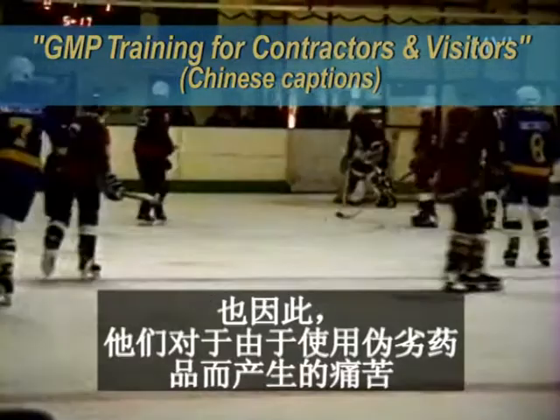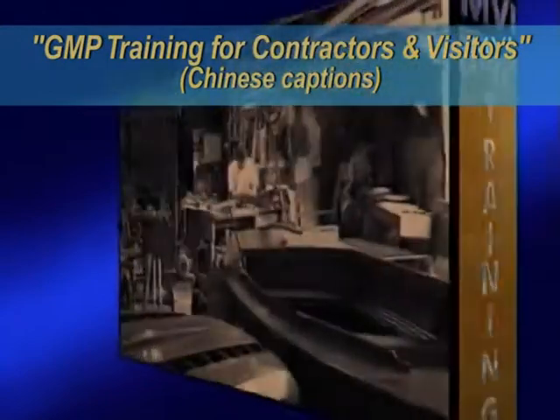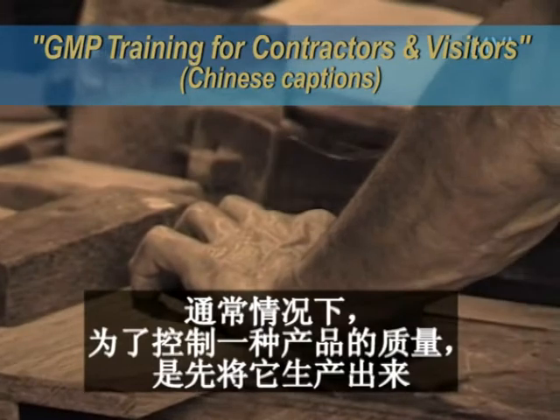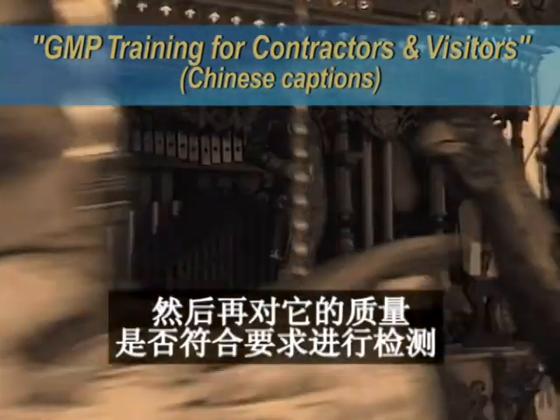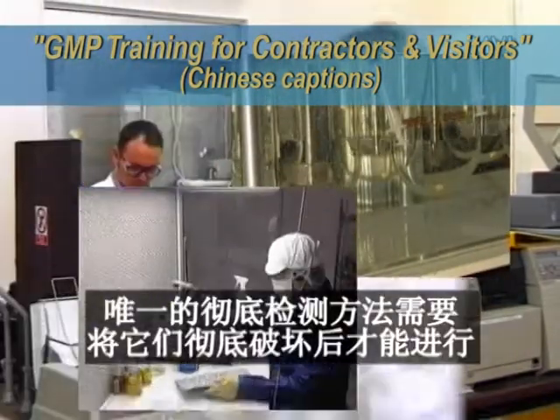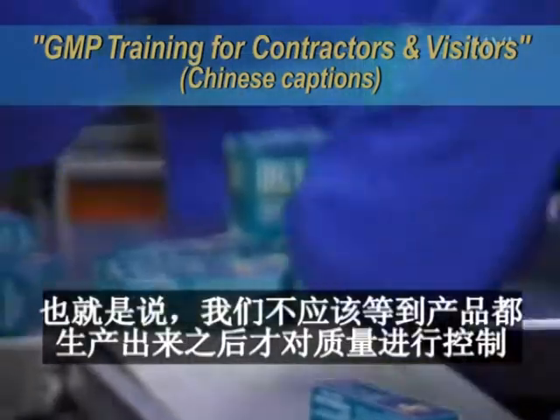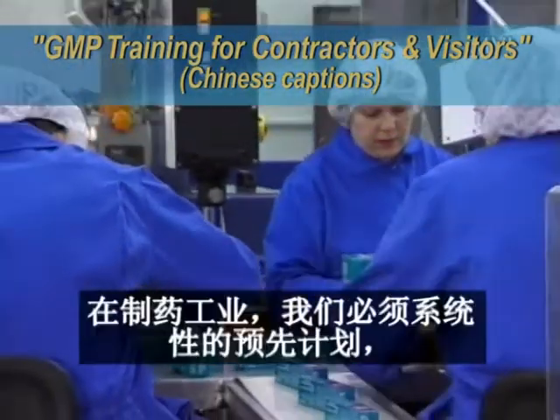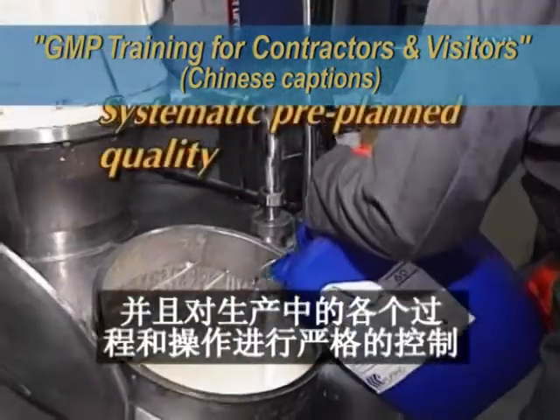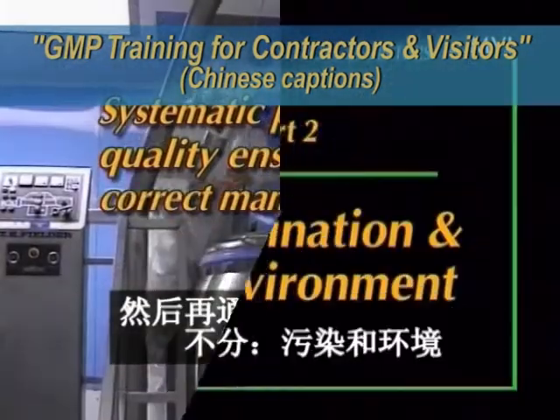The trauma caused by faulty products than someone who's fit and healthy. The traditional way to control the quality of any product was, and sometimes still is, to make it and then to check that it works. Unfortunately, with virtually all healthcare products, the only way to test them requires their total destruction, which means that rather than wait until the production process is completed, in this industry we systematically pre-plan and place strict controls on every activity and every process.